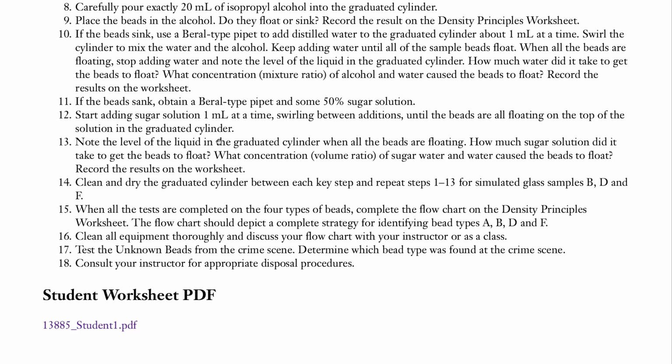Note the level of the liquid in the graduated cylinder when all the beads are floating. How much sugar solution did it take to get the beads to float? What concentration of sugar water and water caused the beads to float? Record those results in your worksheet. Okay. Now, I didn't test A, so what I'm saying here might be wrong, but it might be right. I don't know if they sink or float yet.